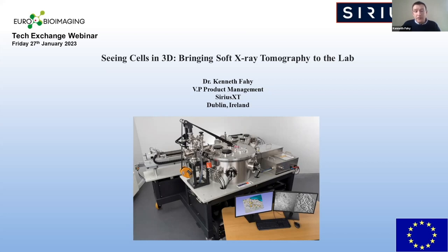So in this talk, I'll give you a brief overview of the technique of soft X-ray tomography itself. I'll introduce our lab-scale microscope, which we call the SXT100. And I'll give you a flavor of some of the scientific use case projects we are currently working on.